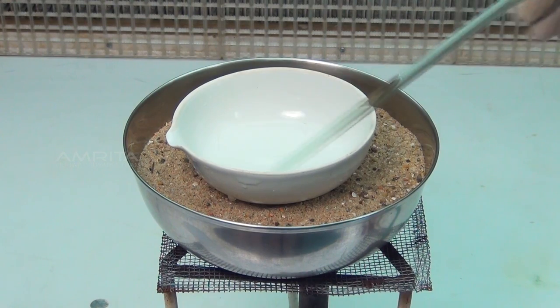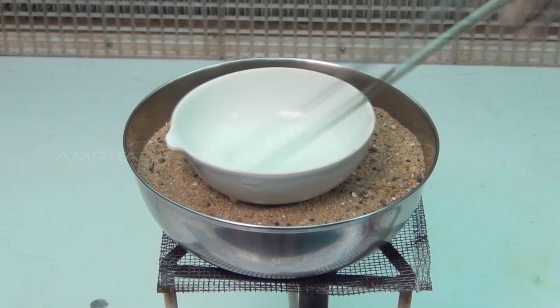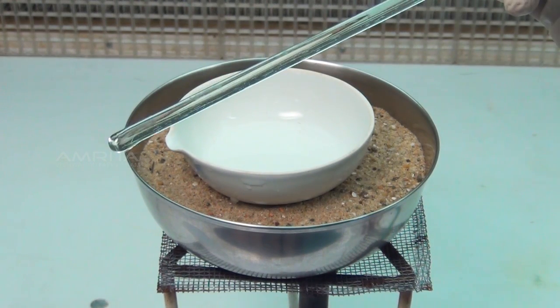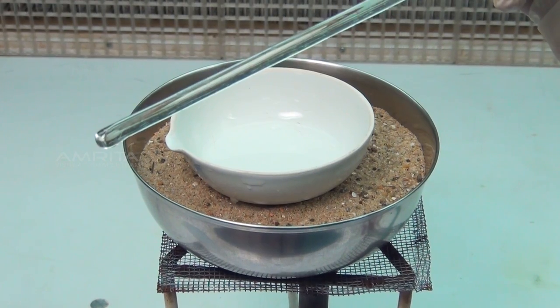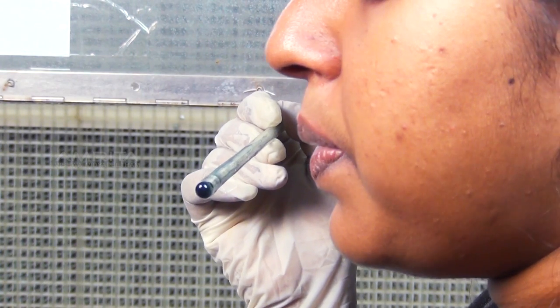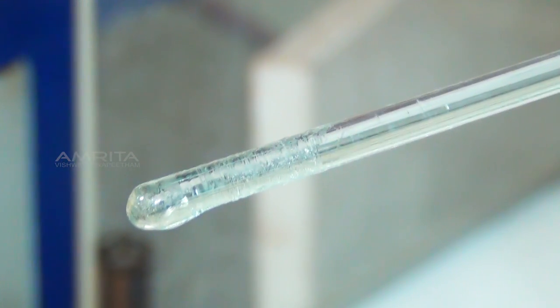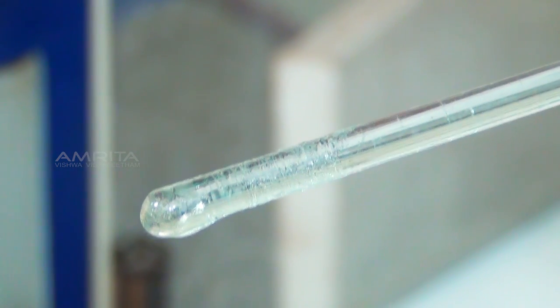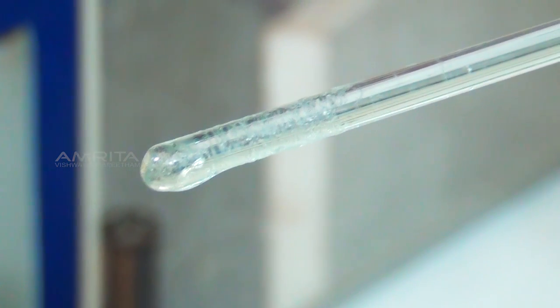To know if the solution has reached its crystallisation point, remove a drop of the solution at the end of the glass rod and cool it by blowing. The appearance of a crust or tiny crystals on the glass rod shows that the crystallisation point has been reached.